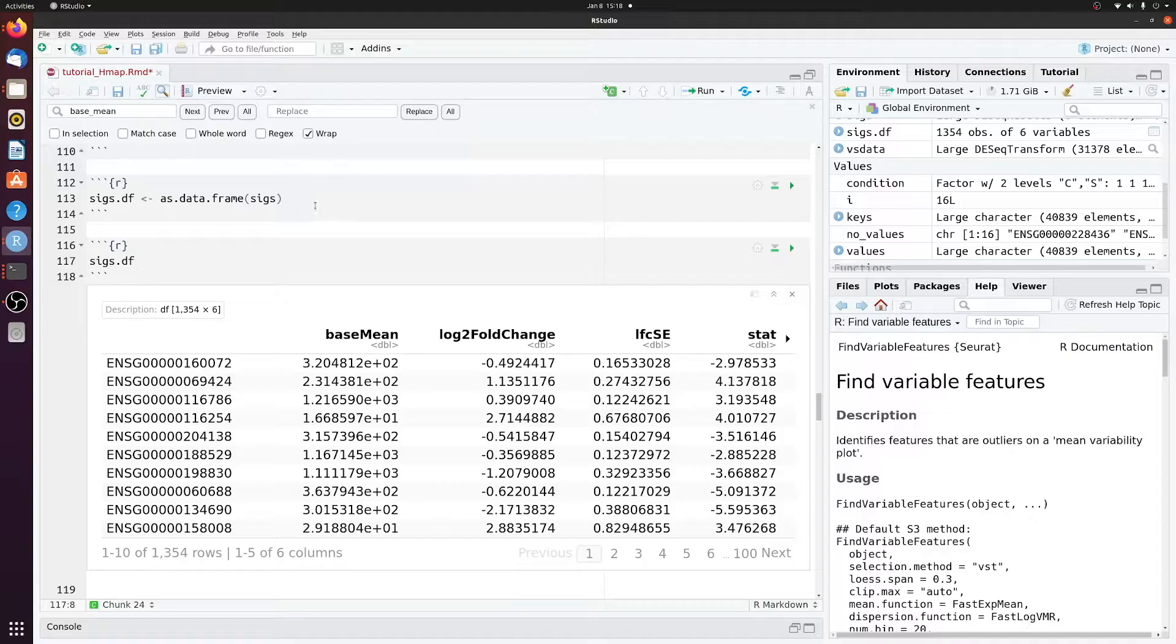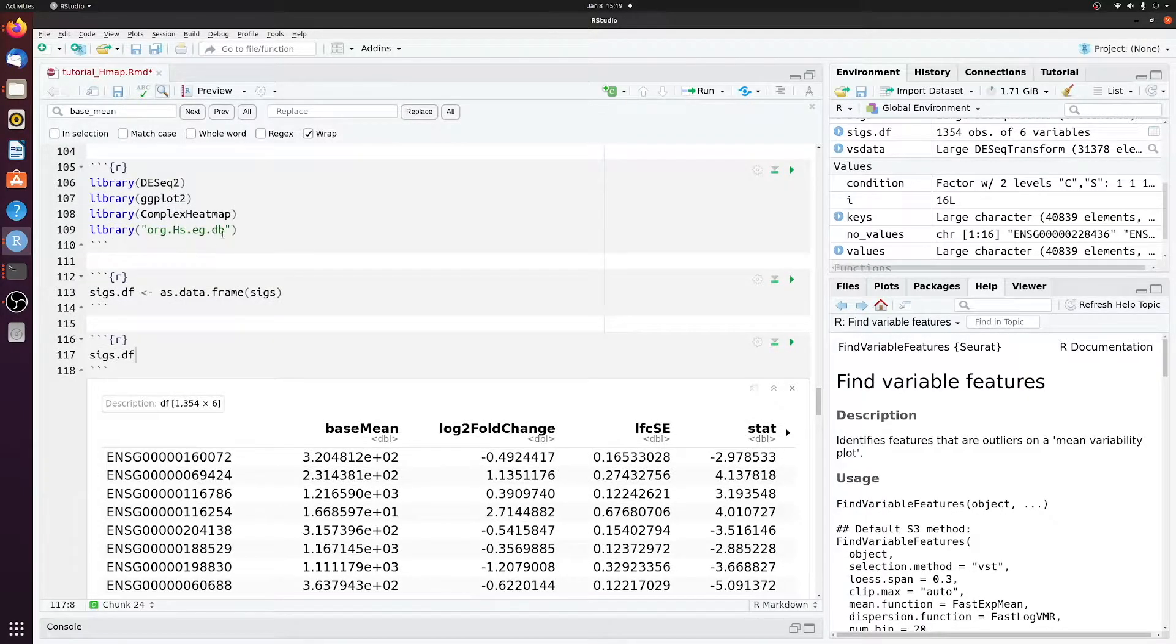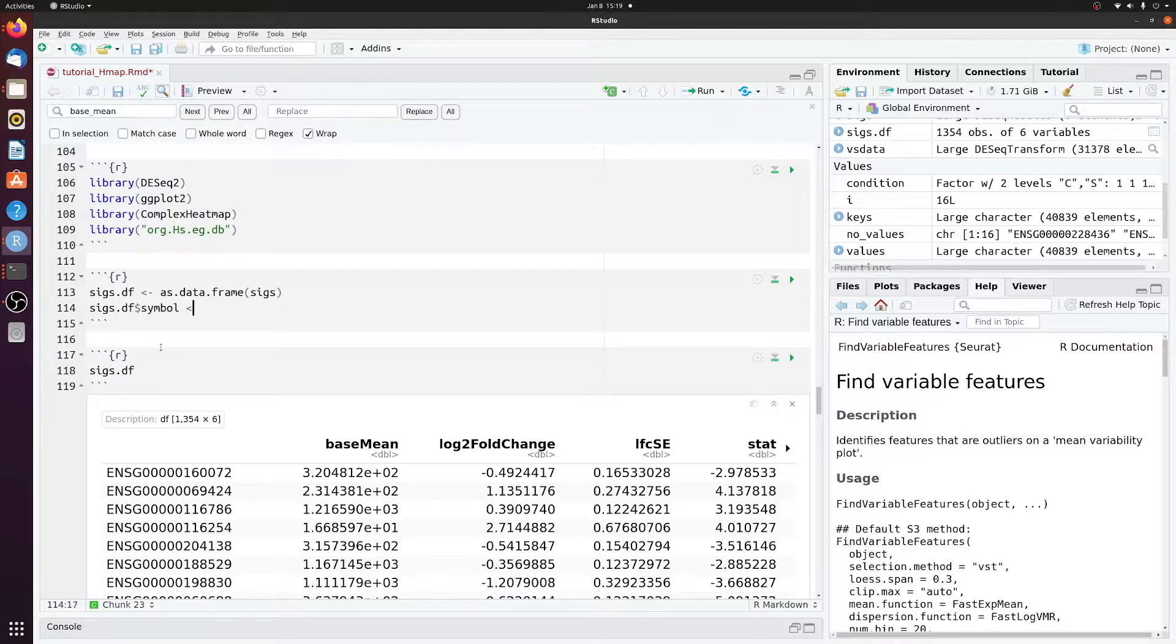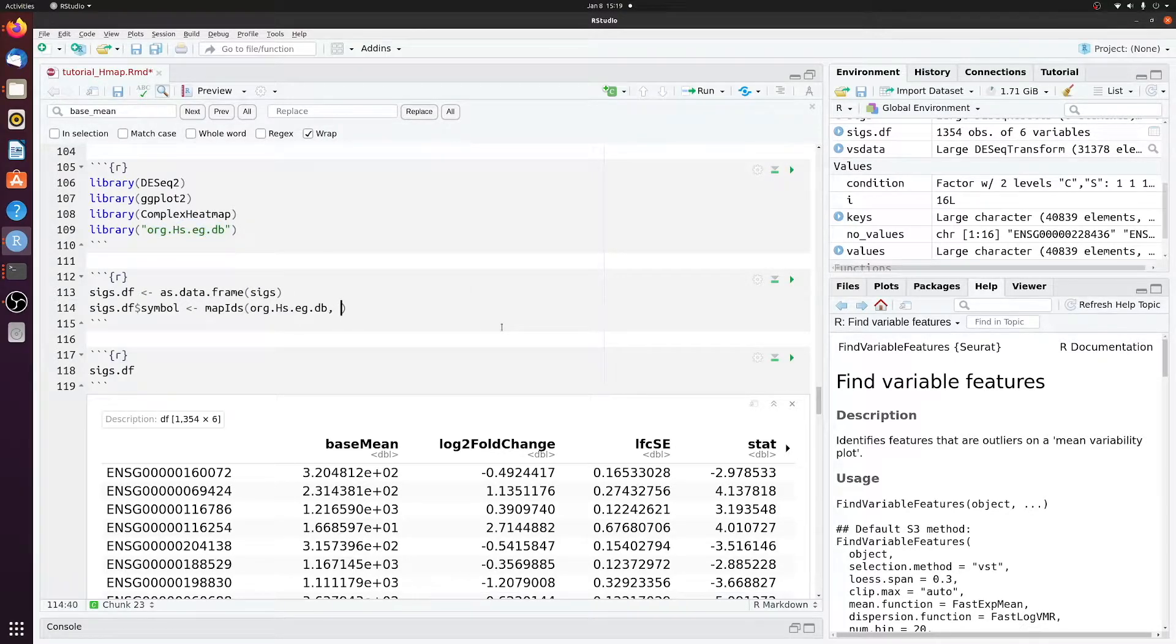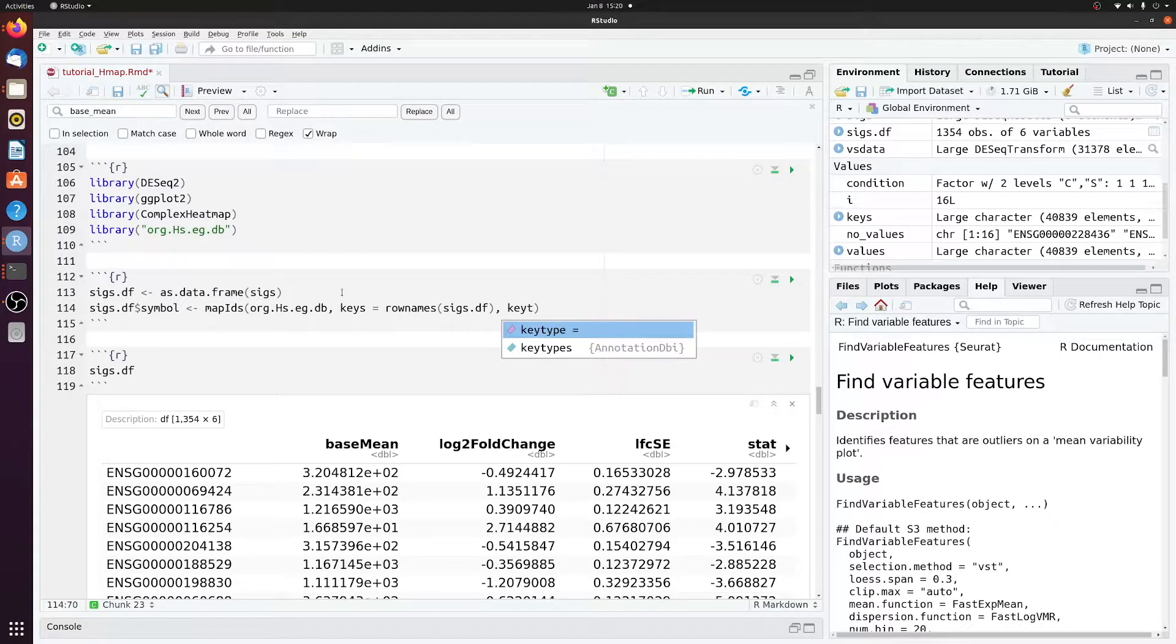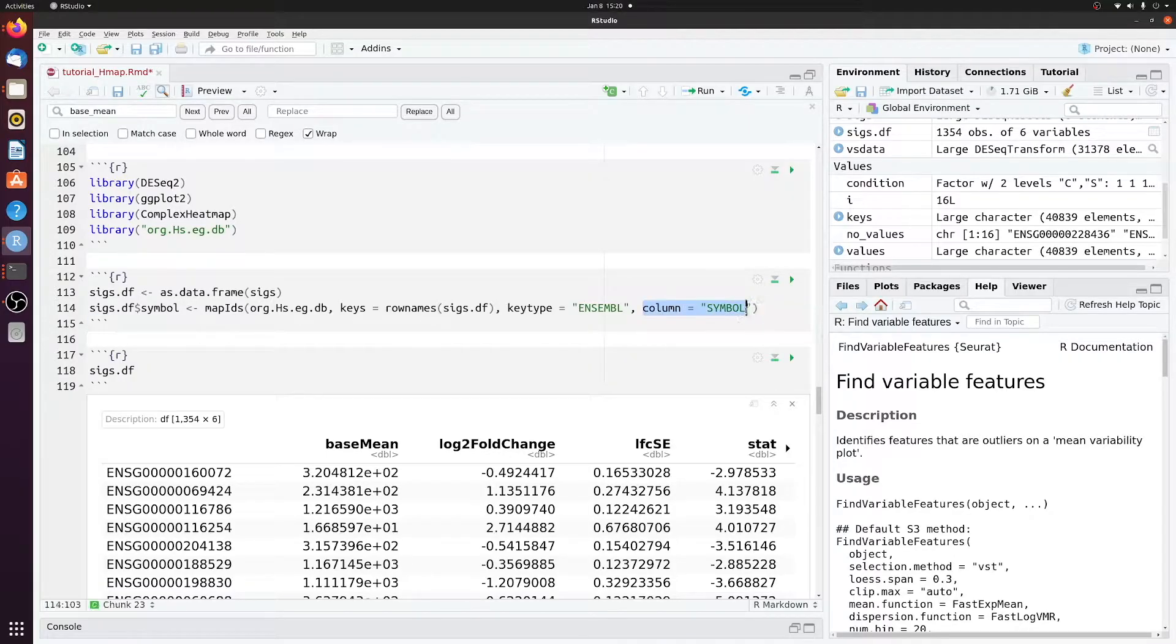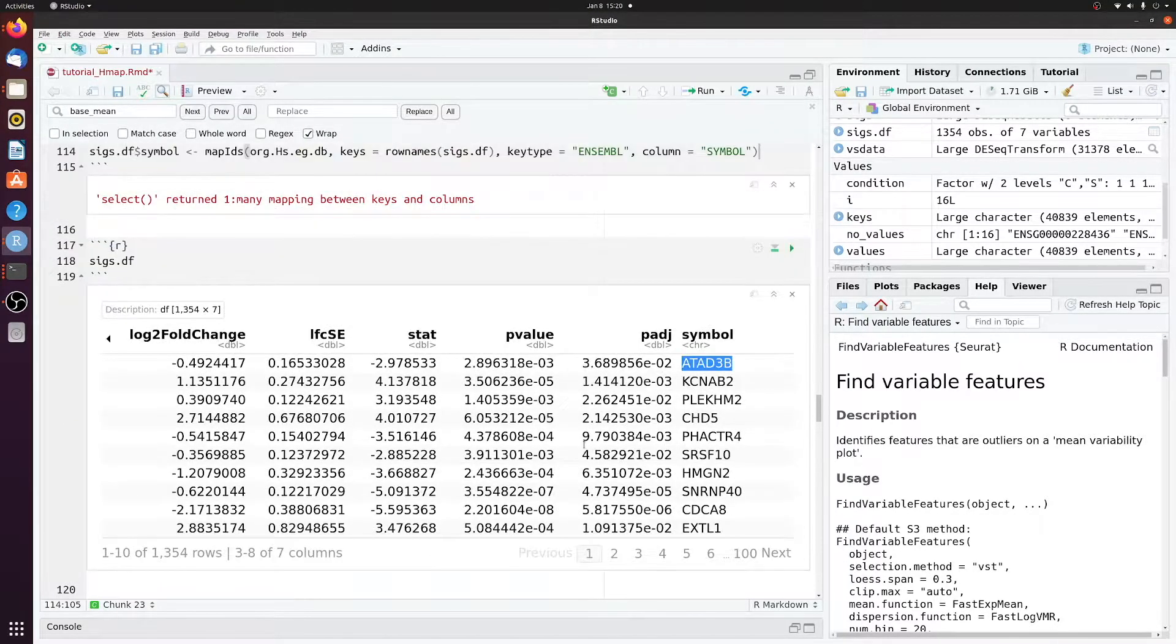Now let's just map these Ensembl IDs to gene symbols, because I don't want to look at a heatmap with these on them, because I don't know what genes these IDs refer to. So we're just going to use this database to map a new column of symbols. SIGsDF symbol map IDs. So we're using this database using the row names of SIGsDF as the keys. And the key type is ENSEMBL. And the column is symbol. This is the lookup column in the database. So now if we look at it, we have a new column symbol with these IDs.